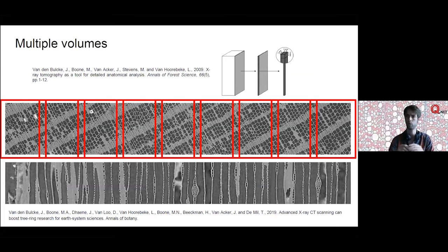Just referring a bit to also what was talked about when talking about confocal laser scanning microscopy, but also the slide scanner that was referred to. So you don't need to stick to a single field of view of your sample or a single object. You can also scan that particular object in 3D in different steps.